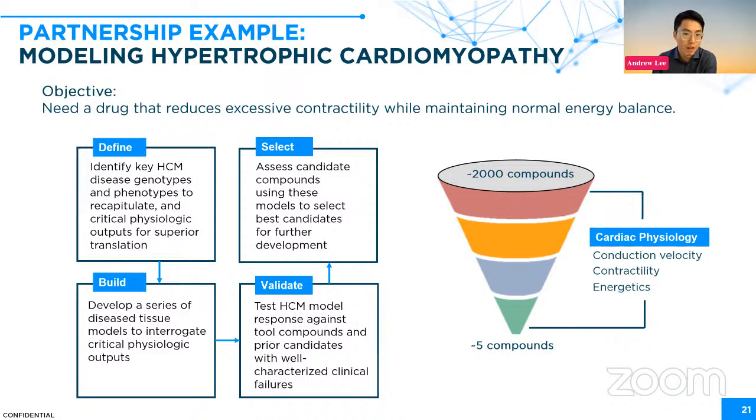What we are very impressed by is that we're actually able to pick out a lot of the relevant metrics at day 14. Whereas, if you think about your maturation process from birth, your heart is constantly developing over the course of years. So how long the tissue needs to last, I don't think we really have a clear idea, but we know that today we can pick out a good set of metrics that we can use to screen compounds. But we also have a lot of room for improving, whether it's maturing by different methods or keeping tissues in culture for longer. All of that is room for improving the tissue and improving the response to drugs.